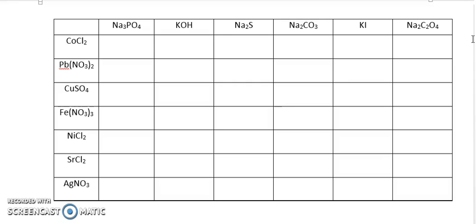At the end of mixing all of these together, I would suggest to pop your phone out and take a picture of what you've done, because you're probably going to need to reference this later on. You should see in the front of the room, on top of the bookcases, the substitute hopefully will find this for you, a stack of lab papers ready for you to accept all of this data. You're going to need to translate your observations onto this page.